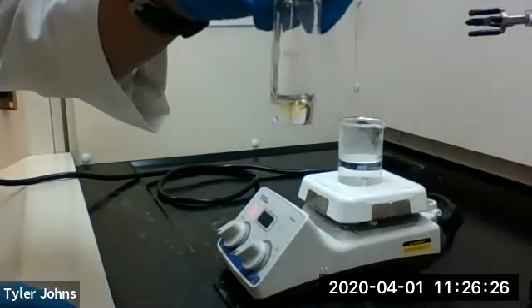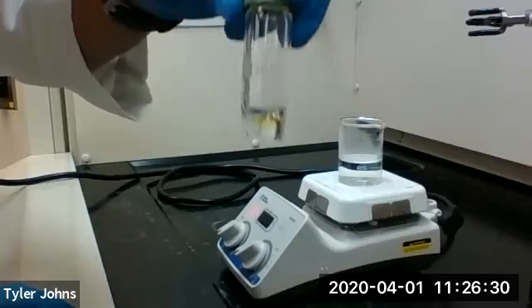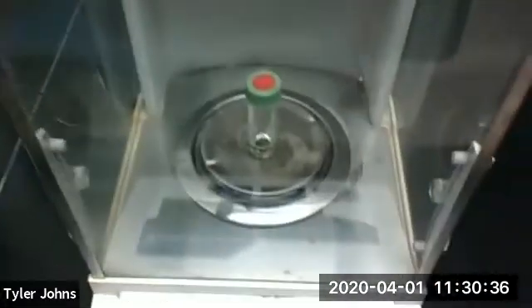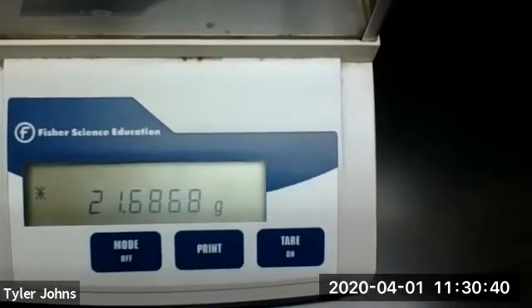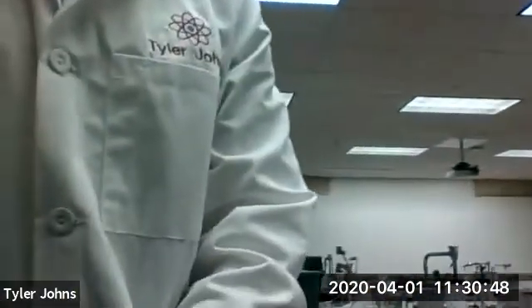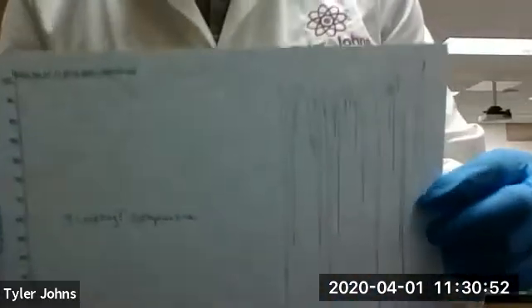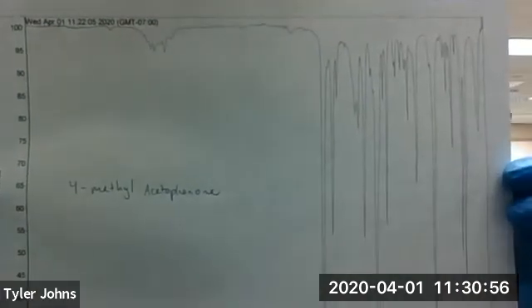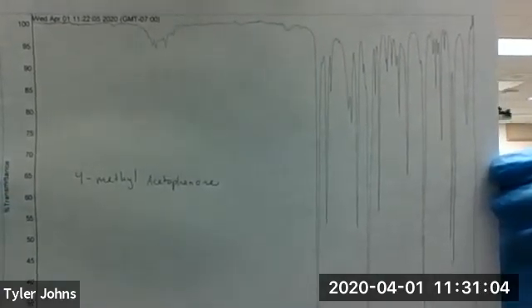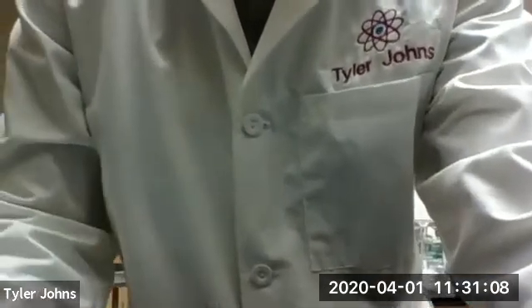We've reached a constant volume, so we're going to go ahead and determine the weight of our final product. The mass of our final product and the conical vial is recorded. This is our IR spectrum of our final product, which is 4-methylacetophenone. We'll be using our 4-methylacetophenone for our next experiment, which will be the synthesis of substituted chalcones.